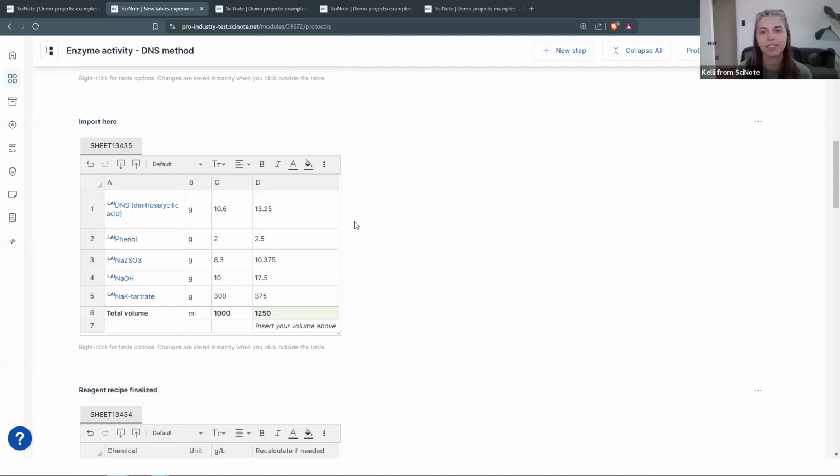Okay. So our next question we have here is, will you also be able to import plate layout templates next week? Okay, yeah. Actually, this one will not be supported yet next week. For now, we will add import only to the tables. And for the well plates, we actually postponed it a bit and we will monitor the feedback and the need for this feature. So it's really good that you pointed this out, and we will add this to our suggestions board and introduce it in the next phases of table improvements and well plate improvements.